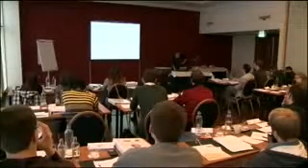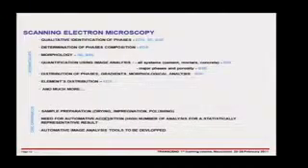The real drawback is the specimen preparation. As I've said, you've really got to dry your sample. Even if you're in an environmental microscope, you're still drying your sample. You've got to support your sample with resin, and you've got to polish it. And this is a long process. It takes typically a day or so to prepare a sample. There are no shortcuts. But when you've done that, you have got a very valuable specimen from which you can really learn an awful lot.